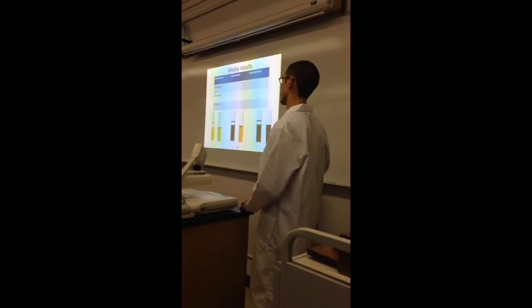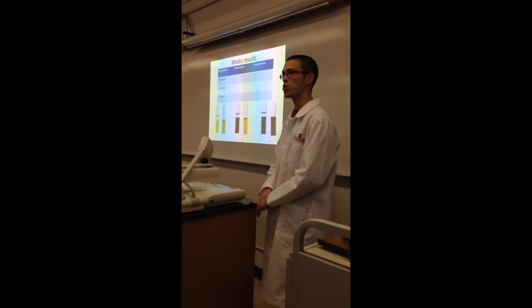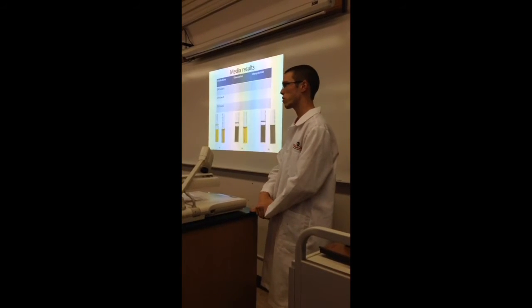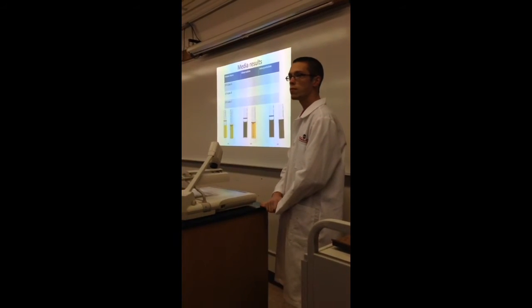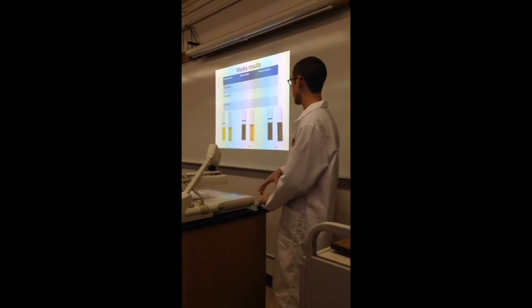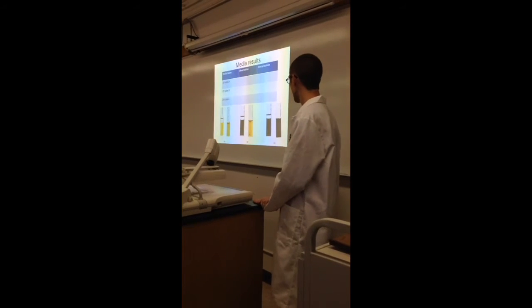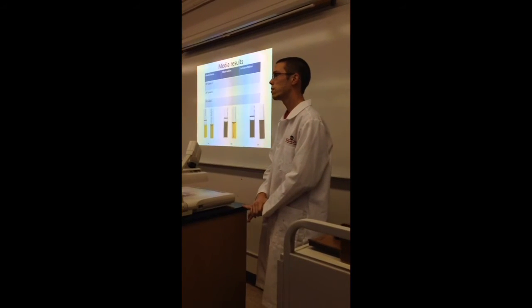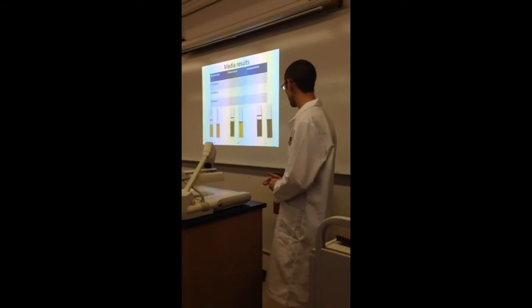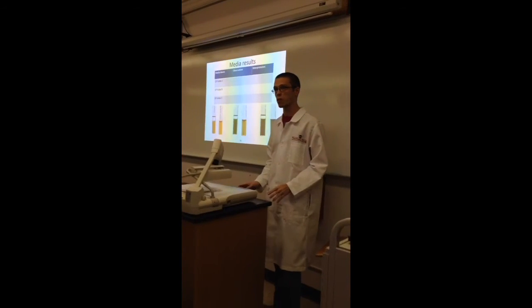The observations are straightforward. I won't make you go through that. It'll be tedious. But what about the interpretations? For A, what would your interpretation of that be? Right. When both the anaerobic and aerobic tube turn yellow, that means that fermentation is taking place. What about for B? Right, oxidative respiration. Something that I will note for B is that in this example, the entire tube turned yellow, and that's perfectly fine.